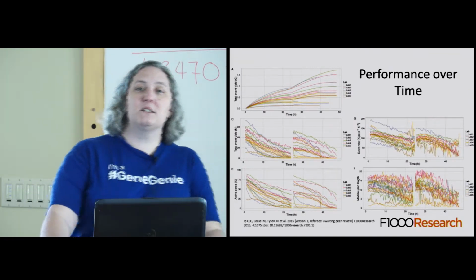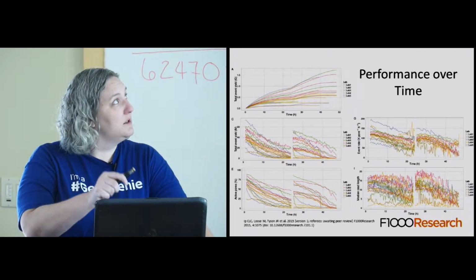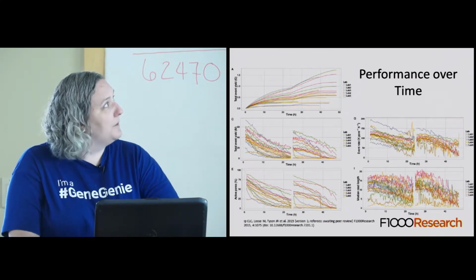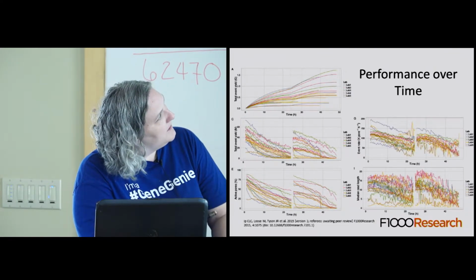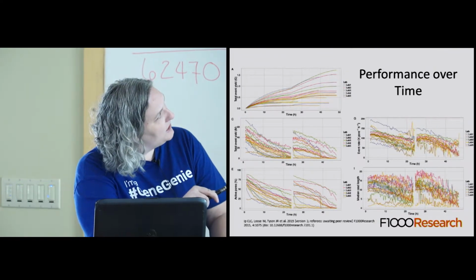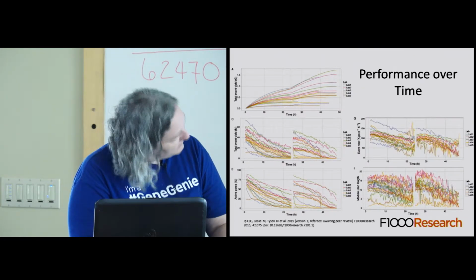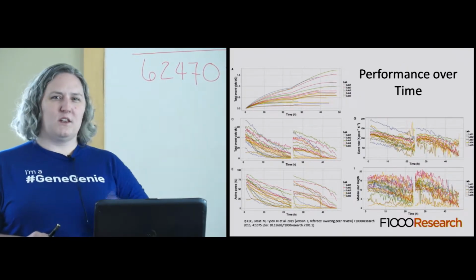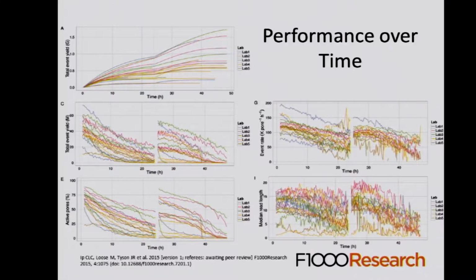There are some custom scripts that exist right now that let you change the time at which this pore selection occurs, but those are not currently implemented into native Oxford software. Total yield, unsurprisingly, goes down. This is again the same time point we had the reselection of pores over that 24-hour period, and the number of active pores goes down. For some reason, it doesn't turn on a pore once the old pore died. So that's something I think they're working on, but as a pore dies, they don't replace it. And then that 24 hours is when they actually bring it through there.